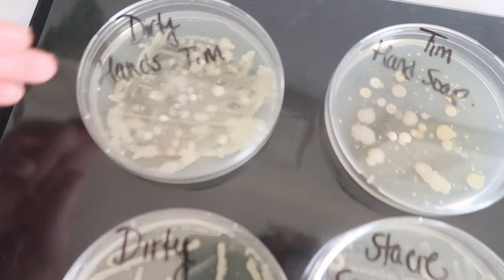So I went ahead and purchased a petri dish set from Amazon and decided to conduct my own little experiment utilizing hand sanitizer as well as hand soap. The test subjects were myself as well as my husband.